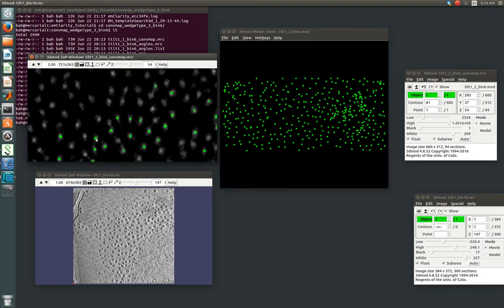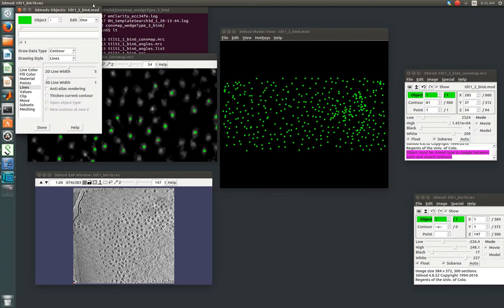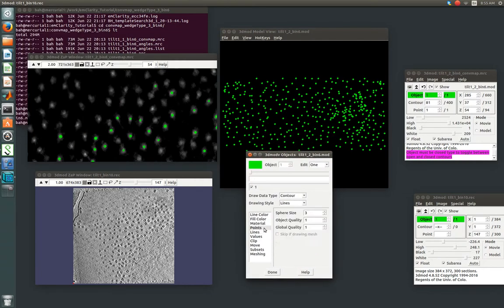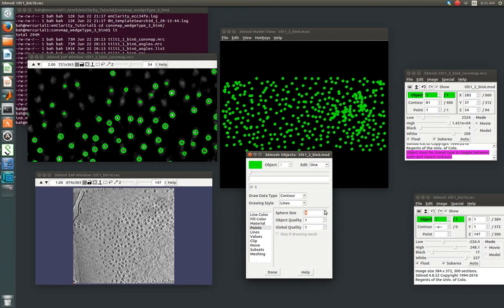Another thing you can do is change the sphere size, which will make these guys a little bigger. Let's actually do that real quick. So again, hitting Shift-O, going to the Points menu, and we'll change the sphere size, which makes our spheres a little bit bigger over here too.